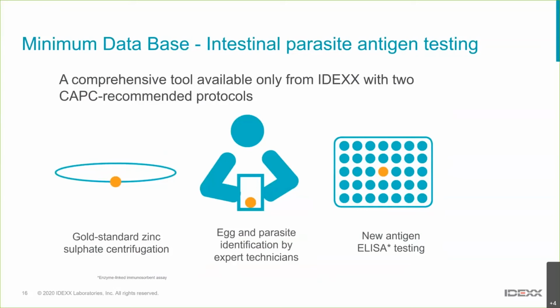So in the lab, we do a centrifugation flotation technique, using zinc sulfate at different specific gravity of solution. So it's the flotation with some centrifugation, and it significantly increases the sensitivity from a simple flotation to doing that technique. And also it has the bonus of, guess what? You don't need to be doing that nasty fecal in the clinic. And we have scientists who are doing that all the time.